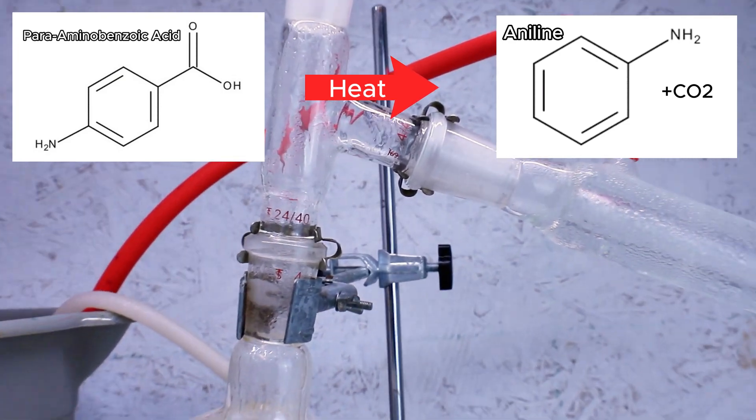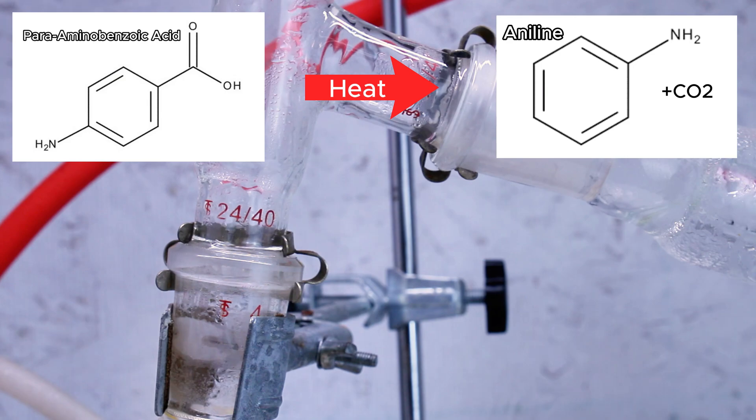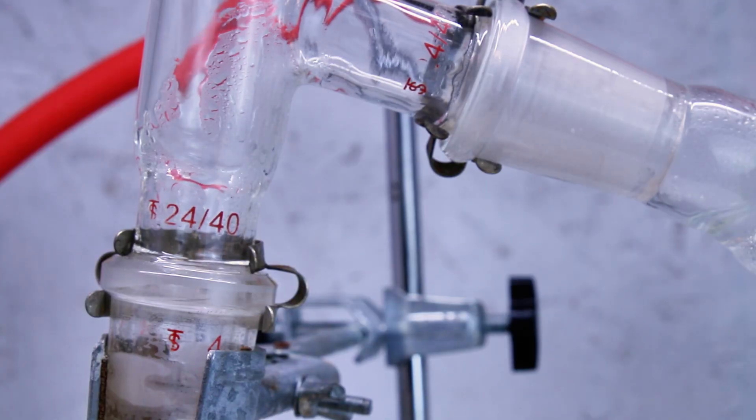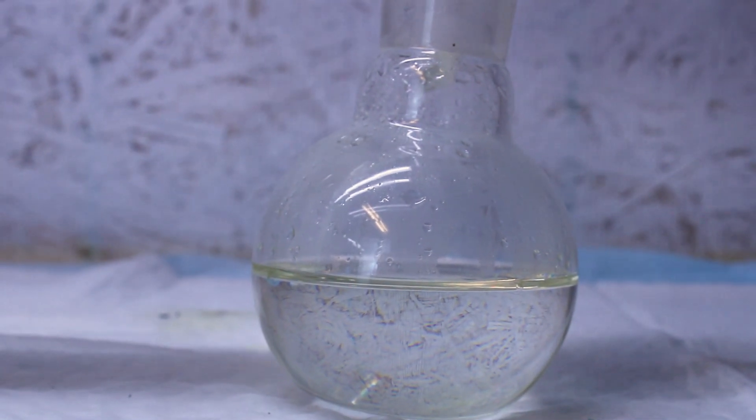When aniline then reaches its boiling point of 184 degrees celsius, it boils away and then condenses into my collection flask. The distillation is continued for about 30 minutes until the rate of aniline distilling over is less than 1 drop every 2 seconds.